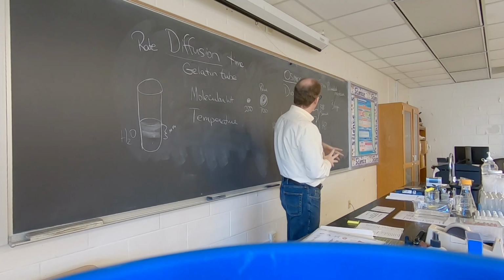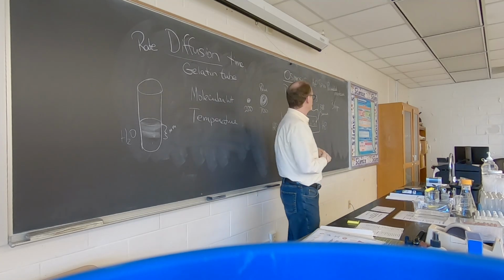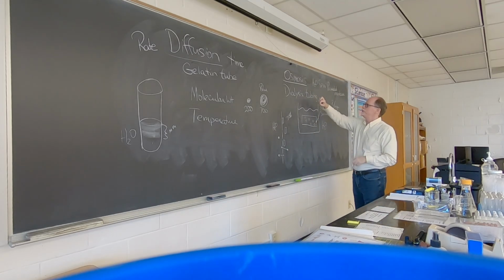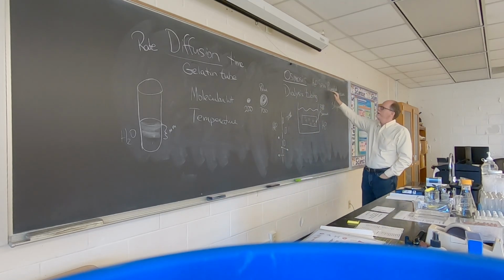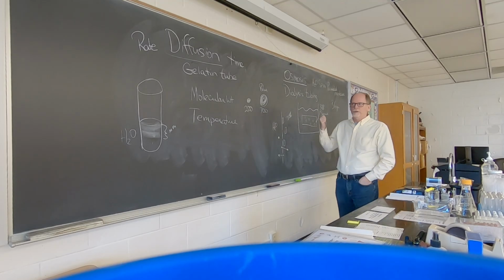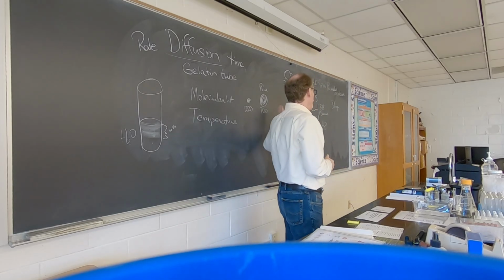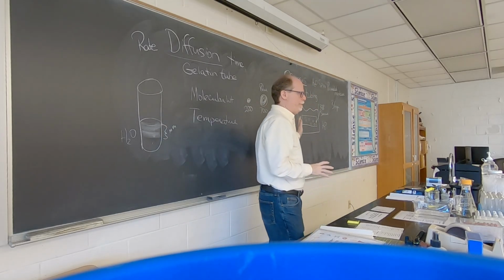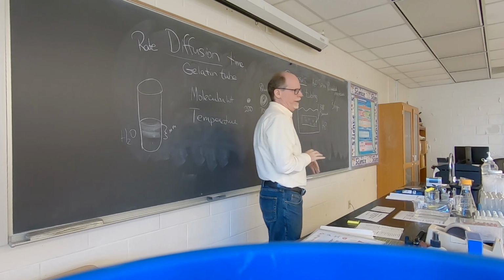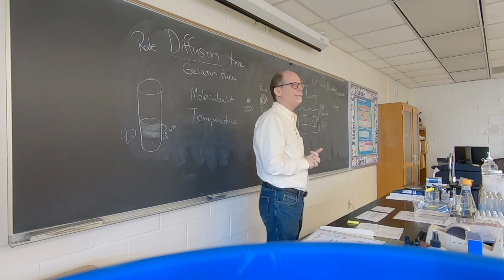But that's the purpose of the dialysis tubing, to demonstrate osmosis, which is the movement of water across the semi-permeable membrane. It's basically diffusion of water. So both cases, these are diffusion, and they would both be considered passive when you compare it to something that's happening in a cell or a biological system.